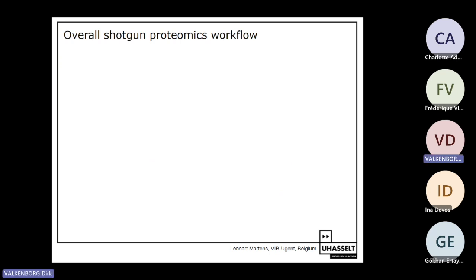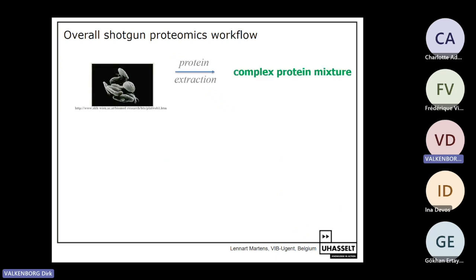This is a slide I got from Lennart Martens from Belgium as well. It gives you a more serious idea about how the overall shotgun proteomics workflow works. We have some cells here that we want to extract the proteins from. So we extract proteins from cells. This is actually most of the work. And then we have a complex protein mixture.